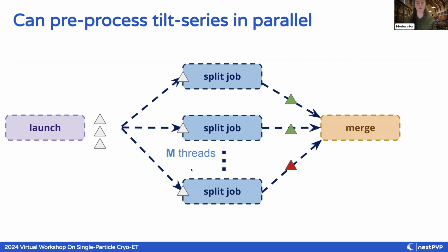And I'm going to grab a new set of 3 to start running in the split job while these go and get evaluated by the merge. The merge is going to know that this one failed and these 2 were successful. So it's going to start to send the failed jobs back to the queue. So we'll see here, these jobs finished, some successful, some failed. The failed will populate back to the queue.